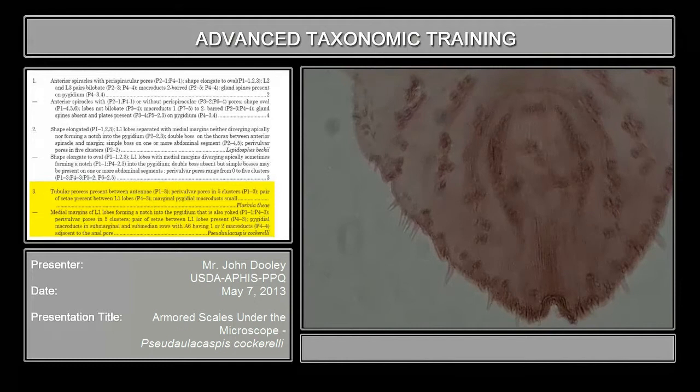Now here — these are your parivalvular pores. There are five clusters: one cluster here that seems to merge almost with the cluster on top, then a medial cluster, and then anterior and posterior lateral clusters. So you have five pairs, and that is also specific for Cochorelli. Incidentally, if you get something like this and you don't see any parivalvular pores — almost all Pseudalocaspis, as far as I know, have parivalvular pores. So if you don't have parivalvular pores and it keys out to Pseudalocaspis, it's probably an immature.